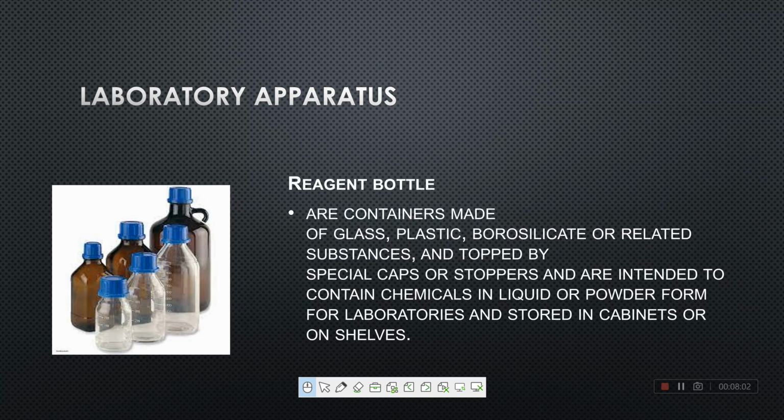Now these are the reagent bottles that are present in the laboratory, which are used to store the chemicals or the solutions. They are usually made of glass, plastic or borosilicate. The material of the reagent container depends upon the type of solution or chemical that is intended to be stored in these bottles. Alright, so there are some solutions that will react to sunlight or light.